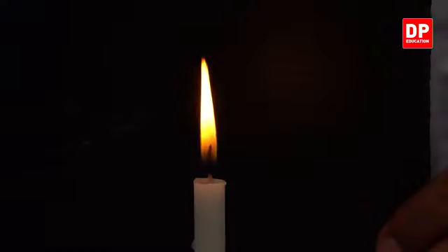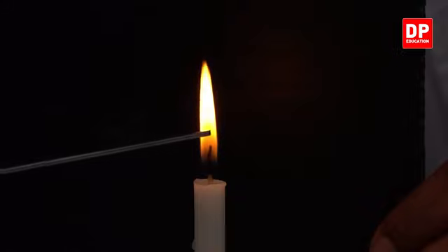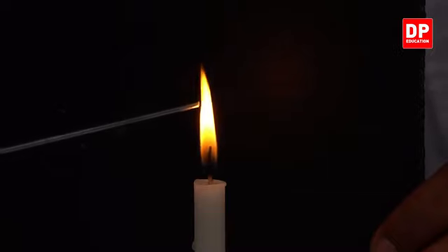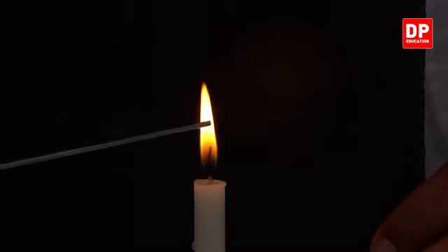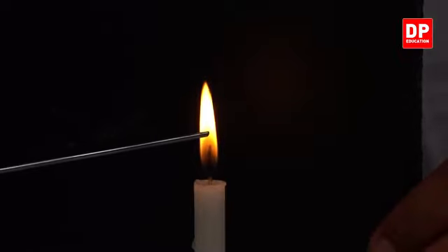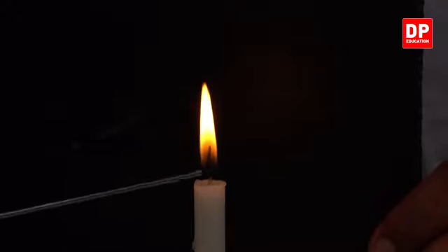So this area after the outer zone, this area here, you can observe that area which I am pointing in here. This area has a bright yellow color. So that area is referred to as the luminous zone of the candle flame. The luminous zone.